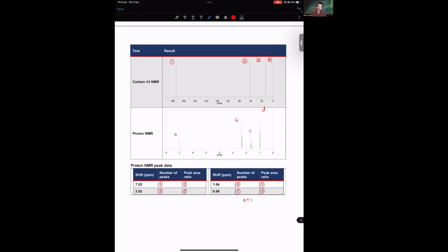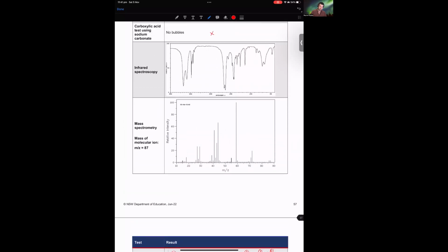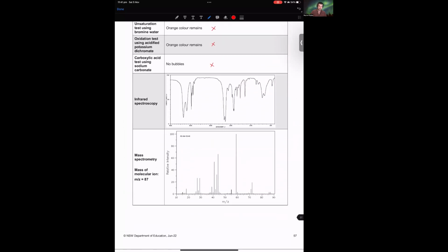The quickest way for us to test this is to come back up to not our mass spec, but our IR. So we can confirm a couple of other things here. So for instance, we can see this classic peak CH stretch. We can see our CH bend.